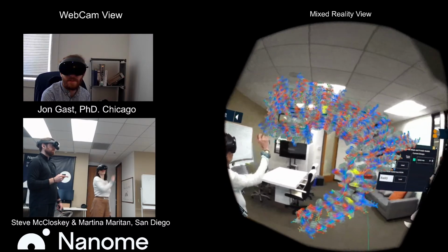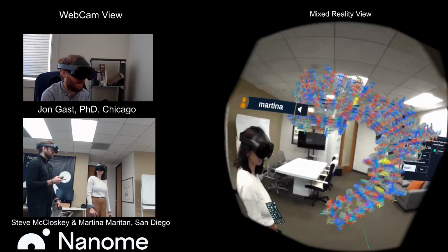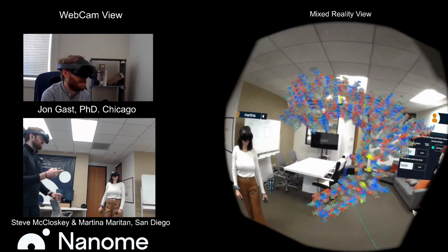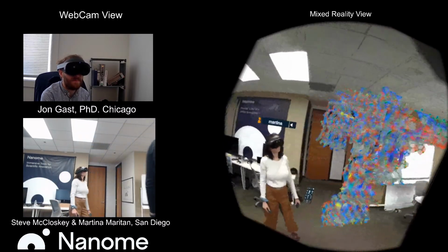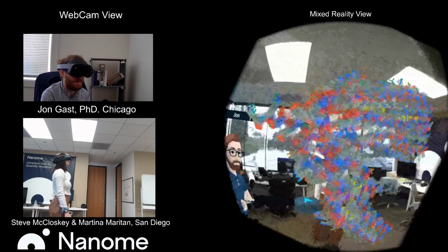Hey, Martina, we're getting a question from the audience. If you could walk around the structure, maybe Steve, it might be better for you to do it just because we're seeing your view. Yeah, sure. Let's flip it around. I'm just going to go ahead and this is me walking around. I do have a cable just so that people could see the stream.